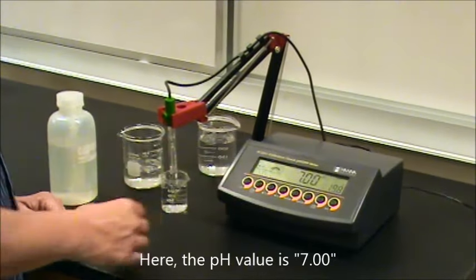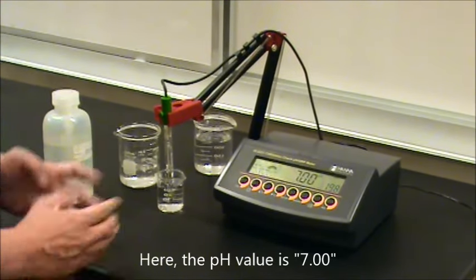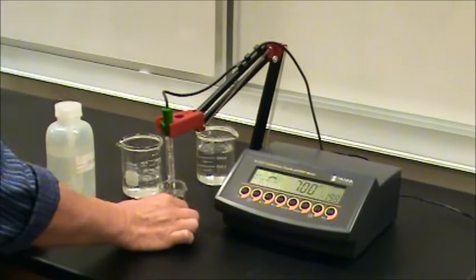In this case it's reading pH 7.00 and it shows that it's working properly because I'm taking the pH of a buffer of pH 7.